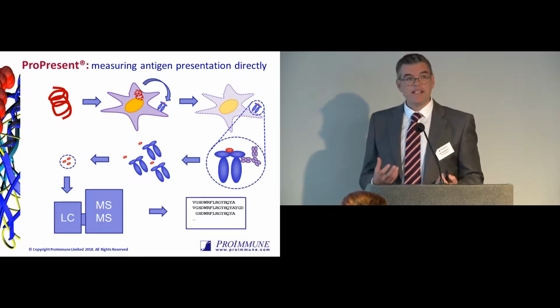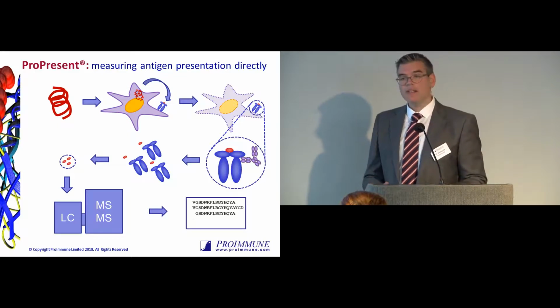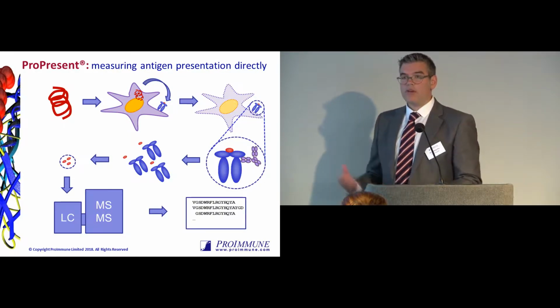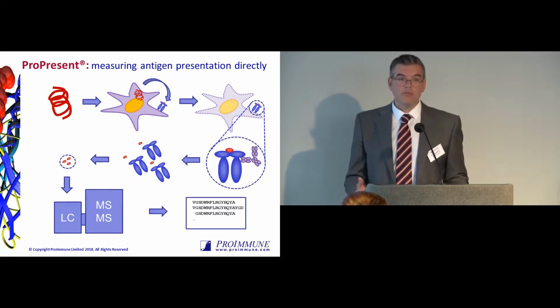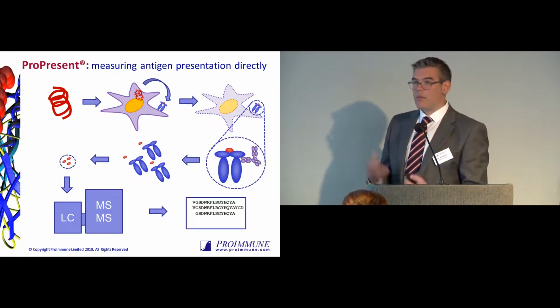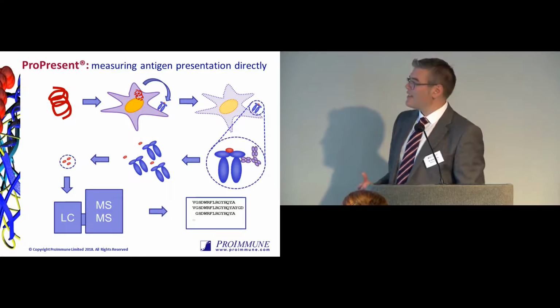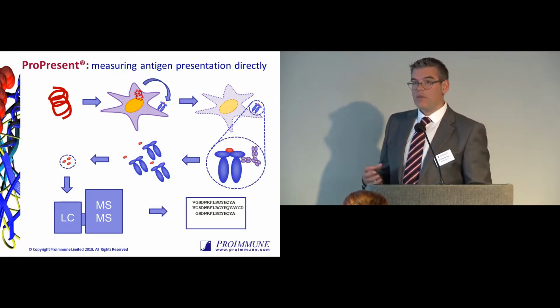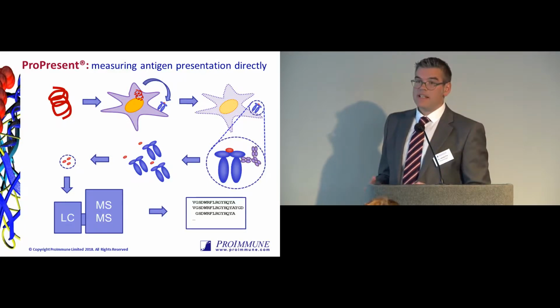What we do is we generate a database, which is the whole human proteome, and on top of that we add in the protein therapeutic sequence, or the mixture of proteins that we're working with. That can be a whole proteome, for example, if this is a bacterial organism and we're working with a bacterial lysate that's been loaded, then of course you can just add that in. And what we report are all the peptides from the loaded material that are presented.